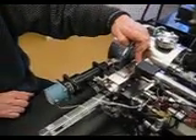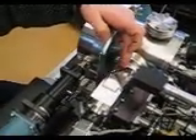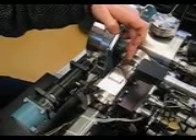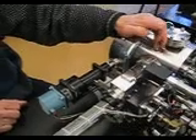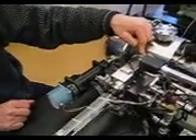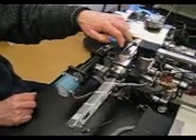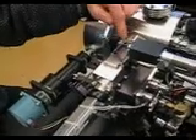This is the interlock chamber that is also used not only to insert a plate into the instrument, but we also use this chamber to eject the plate. The chamber will be pumped down so that it is close to the pressure inside the chamber, and then an inner trap door will open. The molle plate will be retracted into this chamber.